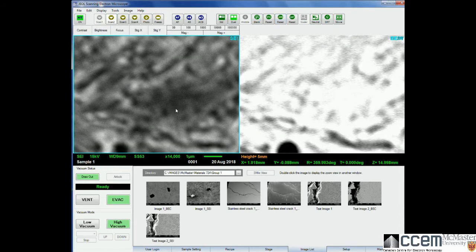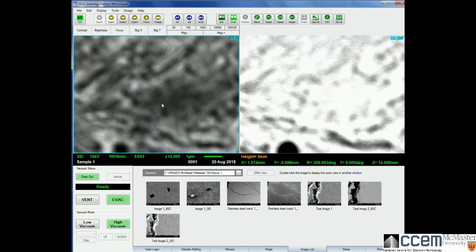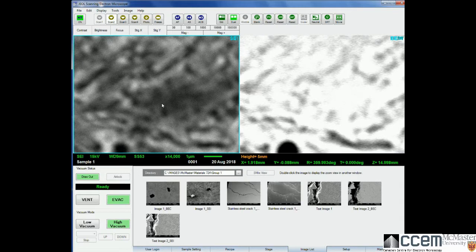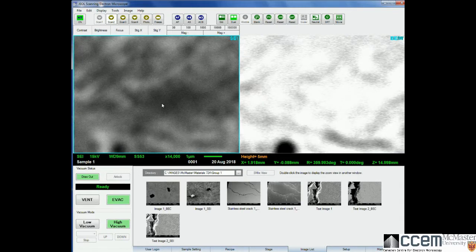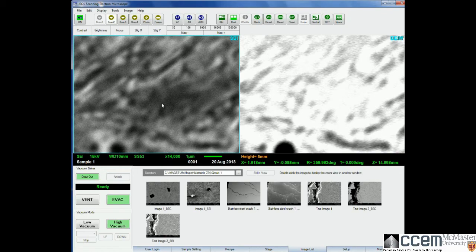And if it goes out of focus, you know you needed to do it. So this now needs to be refocused again, and we probably have to do a little bit of adjustment of the stigmators in order to get it back into a nice clear image.